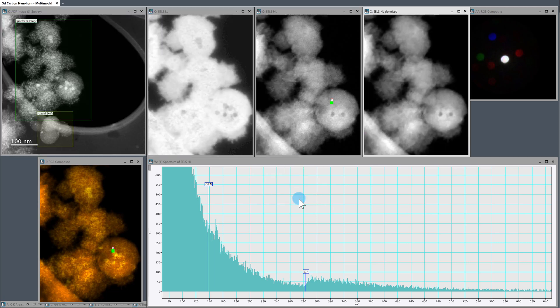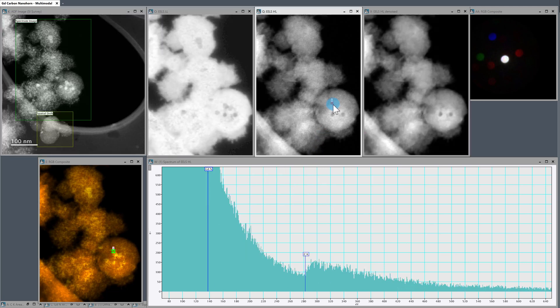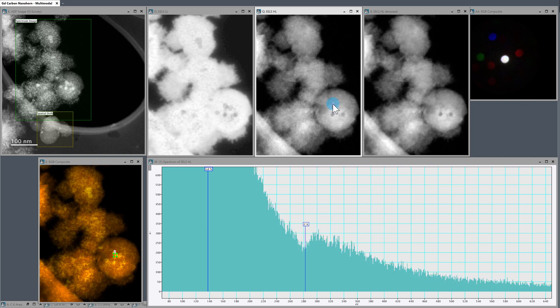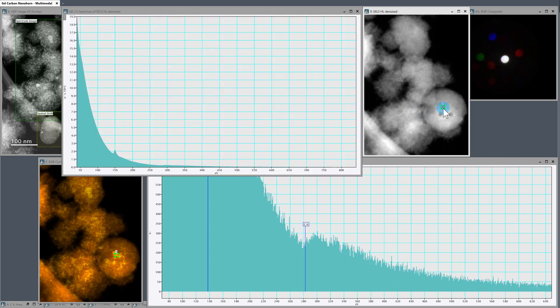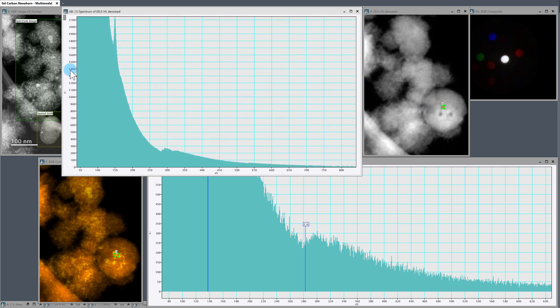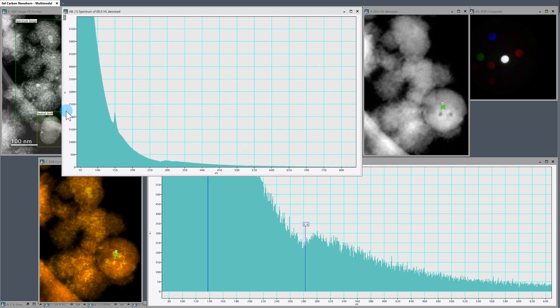Okay, we get our denoised dataset. And then what I want to do, last of all, is basically drag the picker again onto the denoised dataset. You can see the difference is super smooth, like there's no noise there at all.